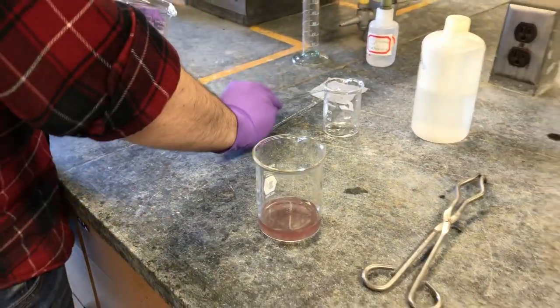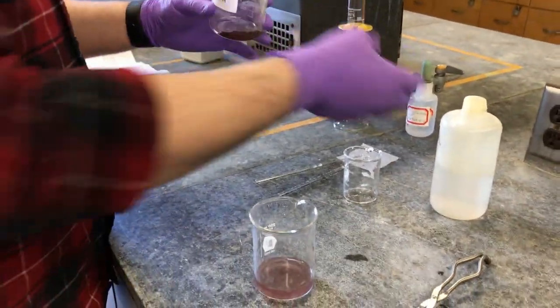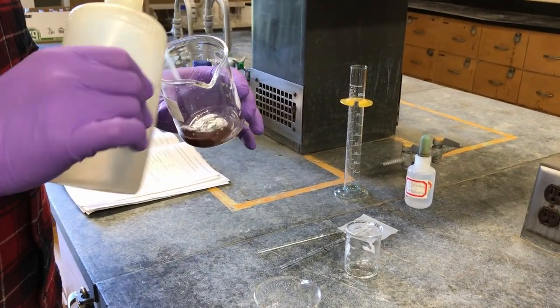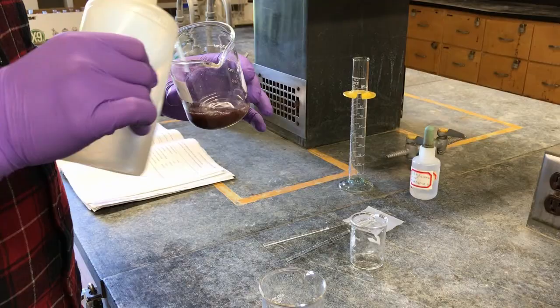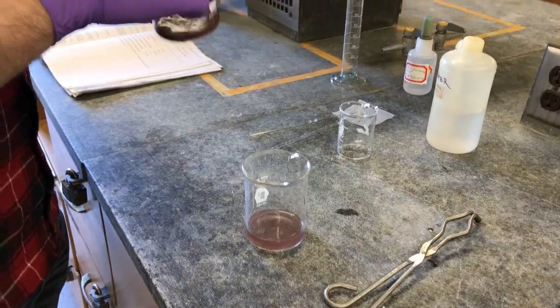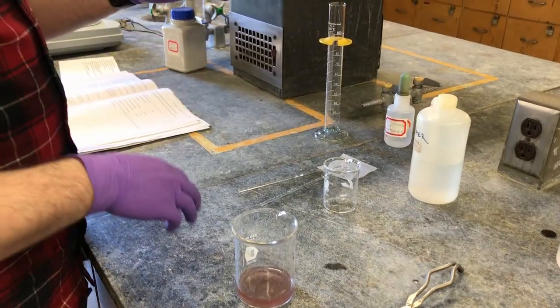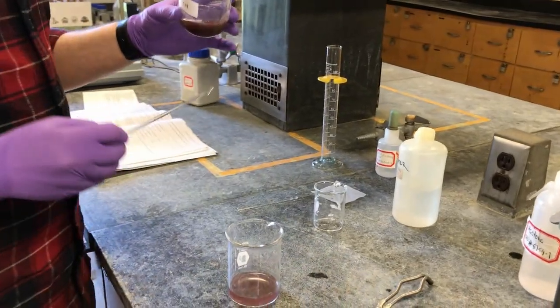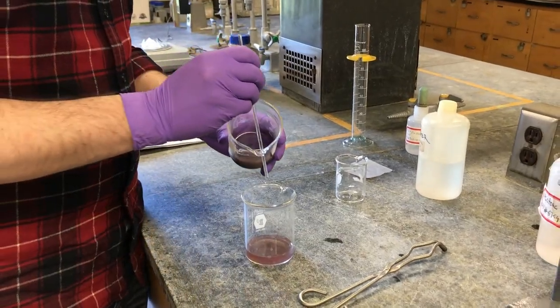So what we're going to do now is wash these copper pieces with approximately 10 milliliters of water. So we're just going to rinse them like so. With our distilled water, we're going to swirl it around, let it settle a bit, and we're going to decant.